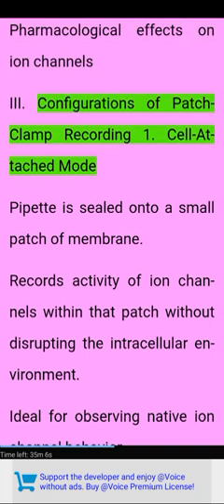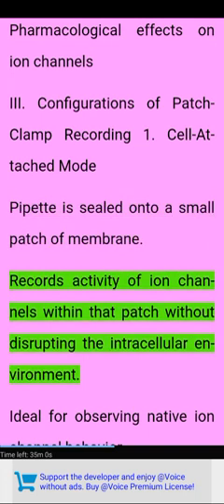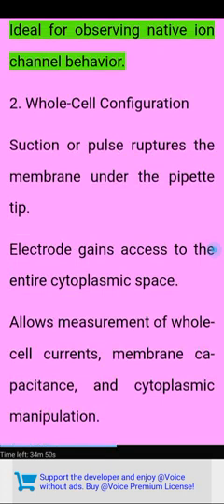3. Configurations of patch clamp recording. 1. Cell-attached mode. Pipette is sealed onto a small patch of membrane. Records activity of ion channels within that patch without disrupting the intracellular environment. Ideal for observing native ion channel behavior.